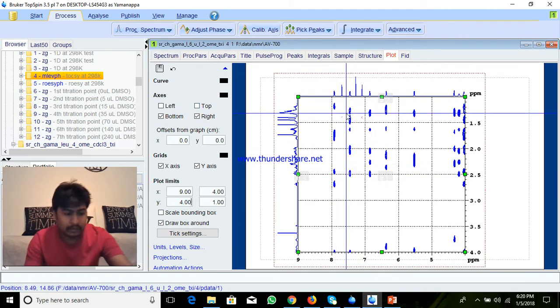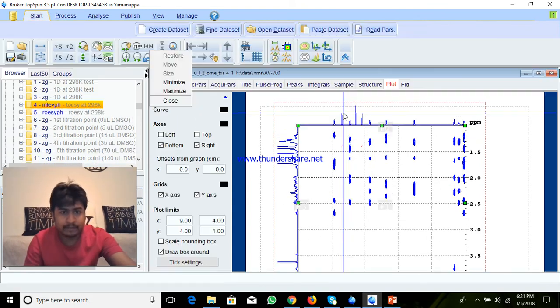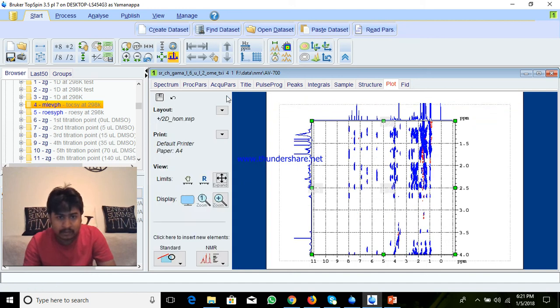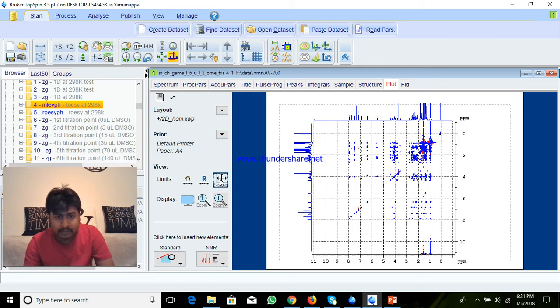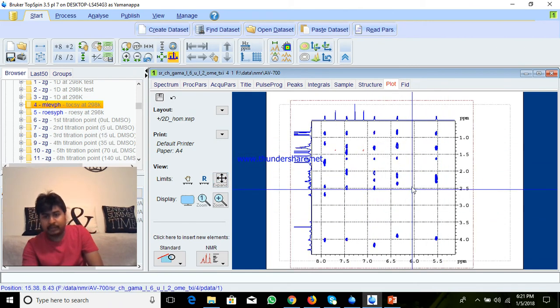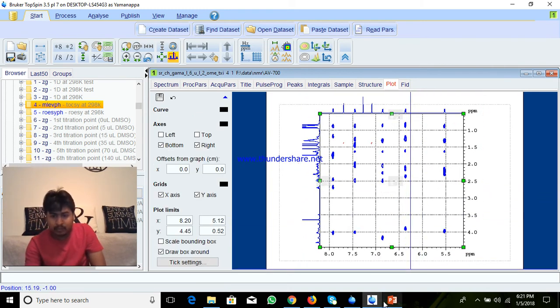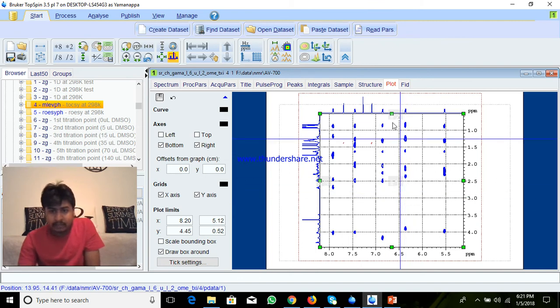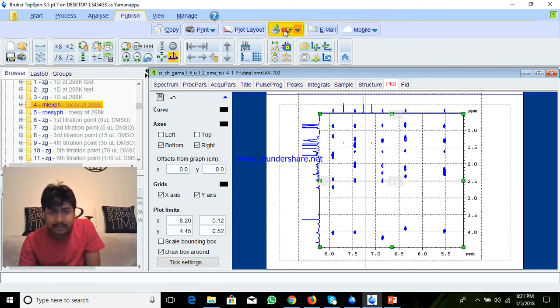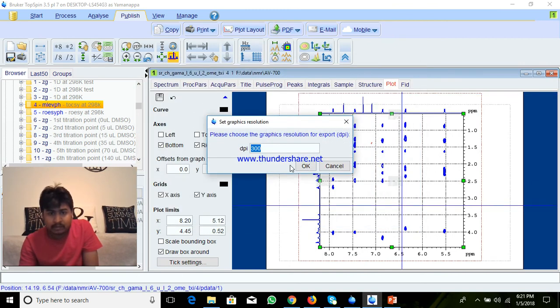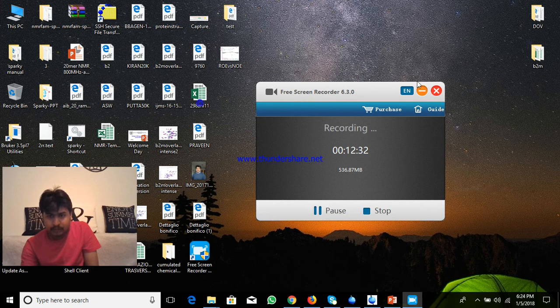If you want to save this as a PDF, go here — Publish PDF — and you can save this as PDF. While saving, you can give the format as PDF, and here you can give the resolution as 1200, or you can give different resolutions if you want. It will show Drawing Contours, and when it finishes, it will show PDF is written.